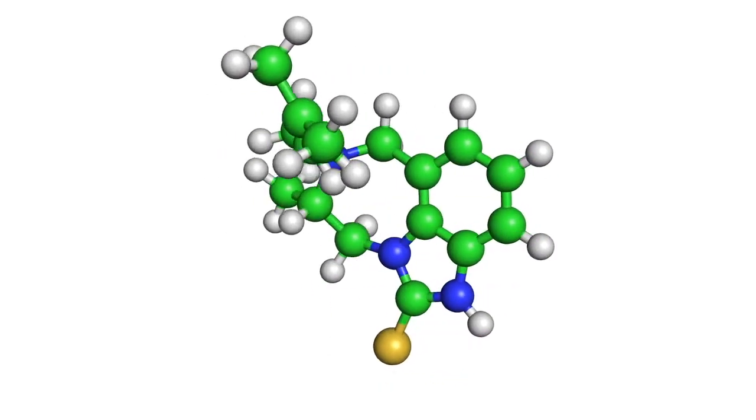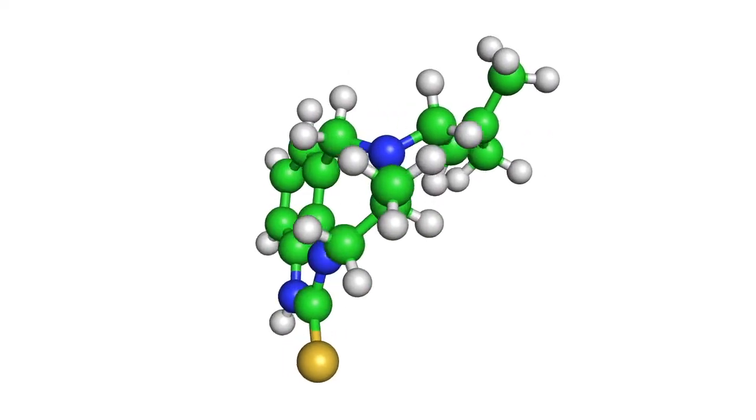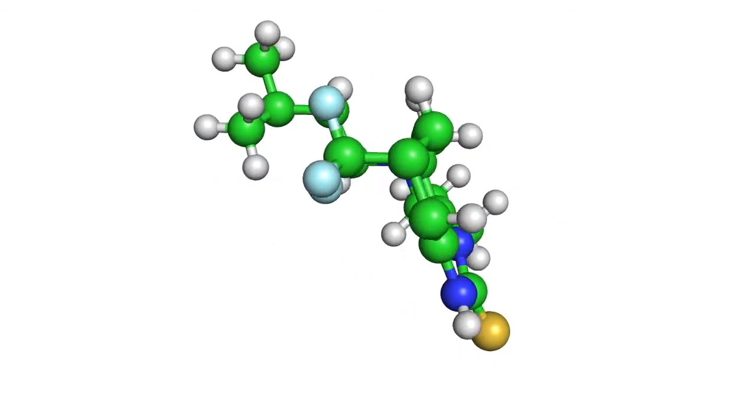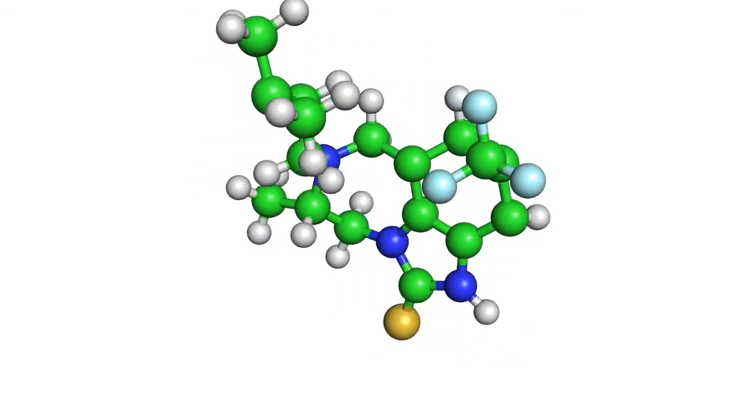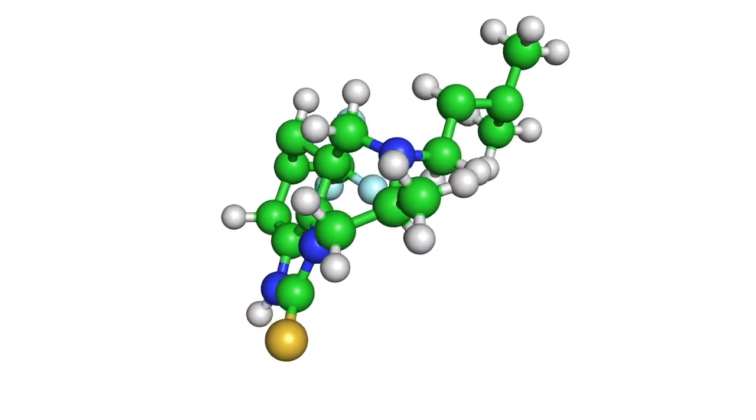Here we can see an example of one of the output structures. This one has a sulfur for the R1 group, and a hydrogen atom for R2 and R3. This one is the same as the previous one, but with a trifluoromethyl group for R3.